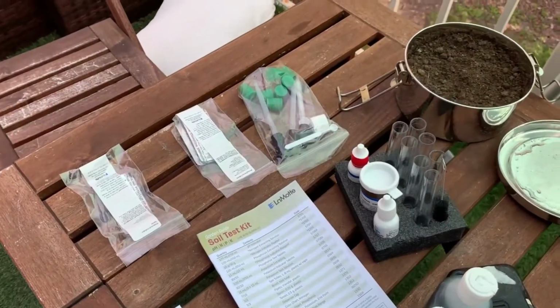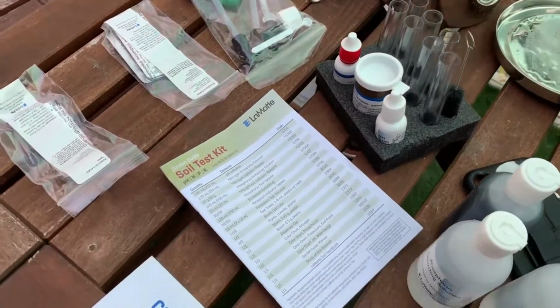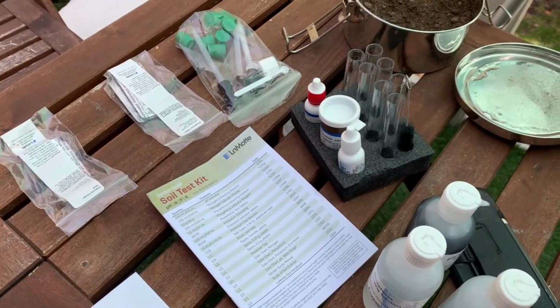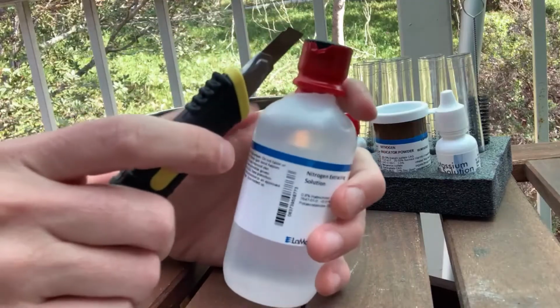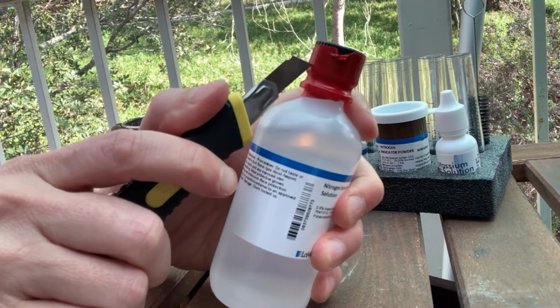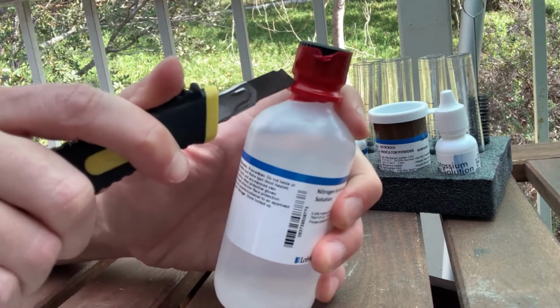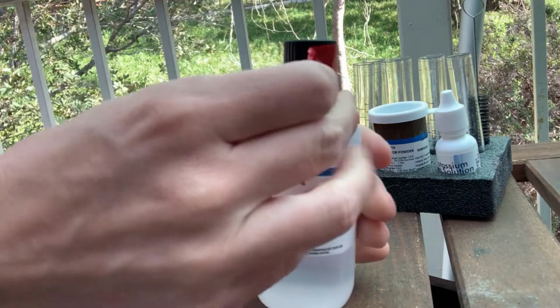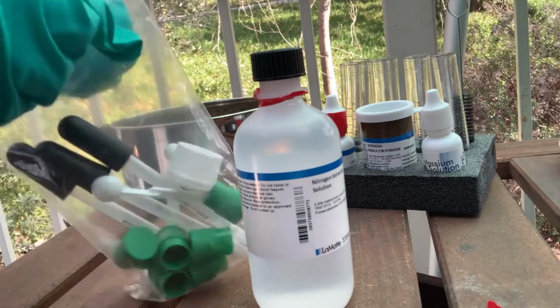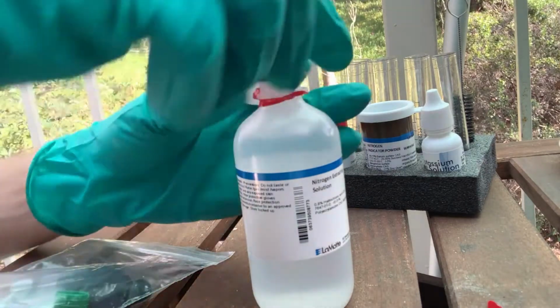So the first thing you want to do is pull everything out of your kit and make sure you read all the labels and that you have all the parts. And for the nitrogen test, you're going to need to open this bottle and use a knife or a pair of scissors to safely cut the wrapper off. And then we're going to want to put the white cap in its place.